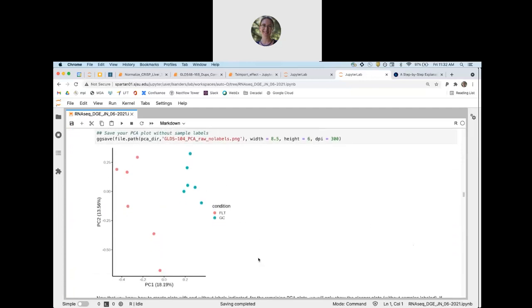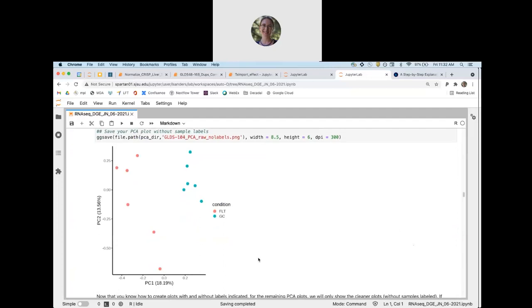All right. Any questions on all that information on the PCA plot?